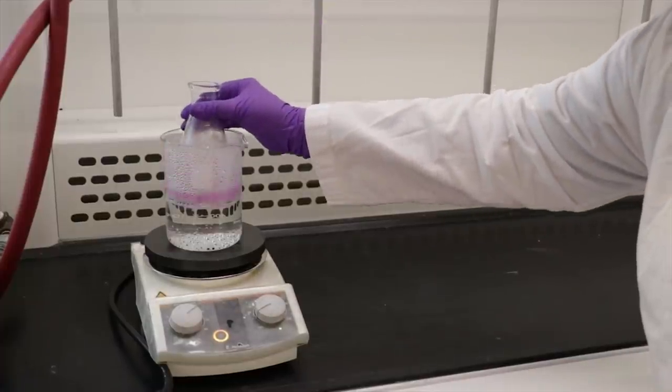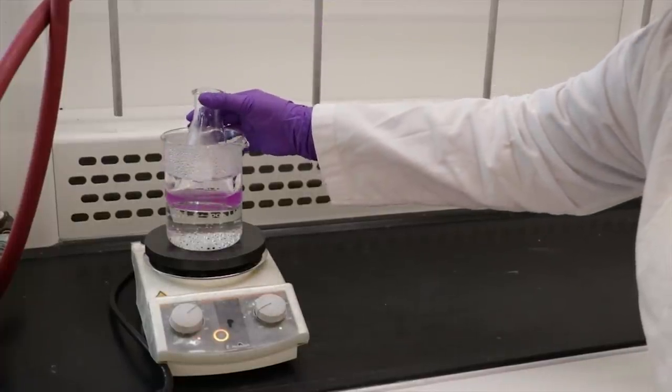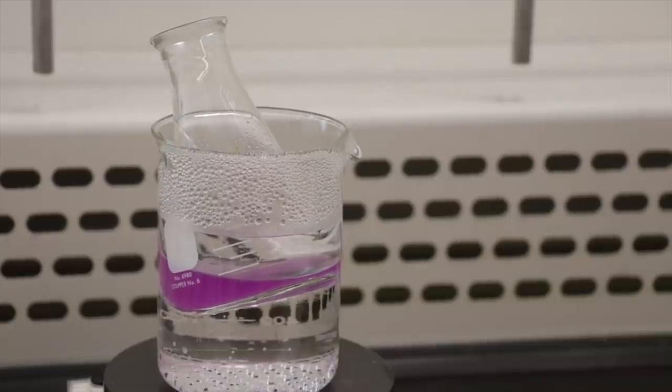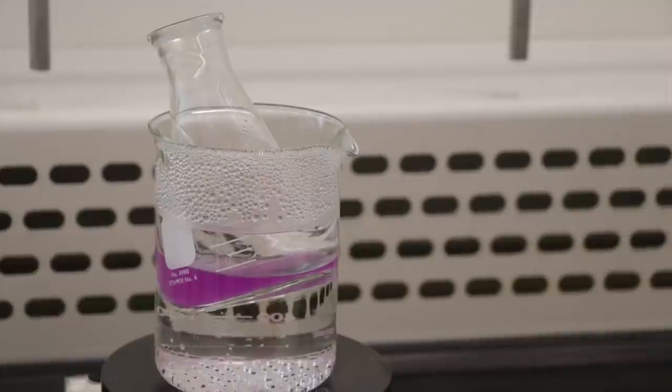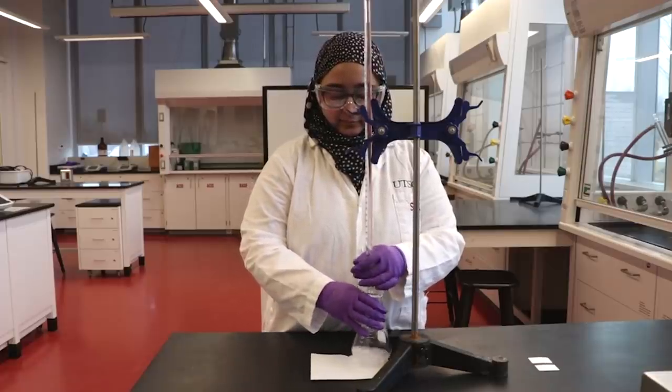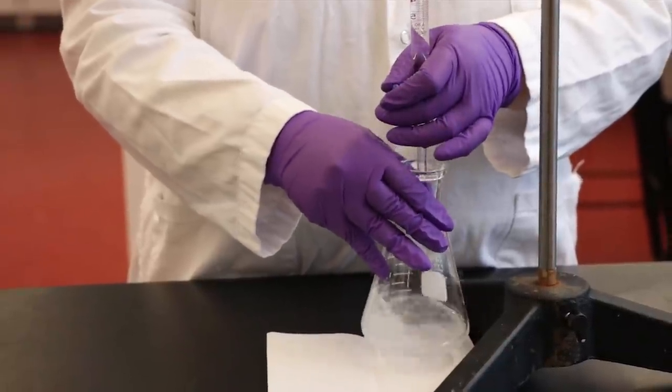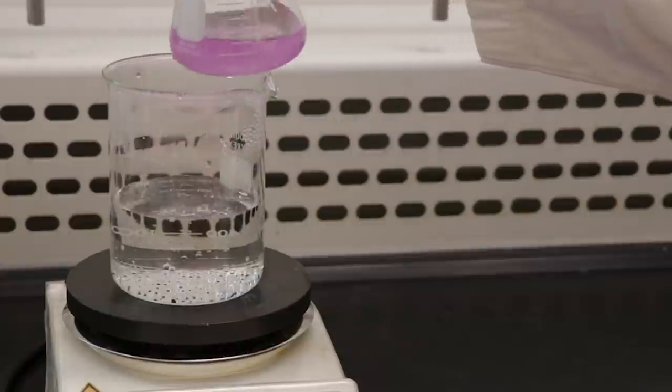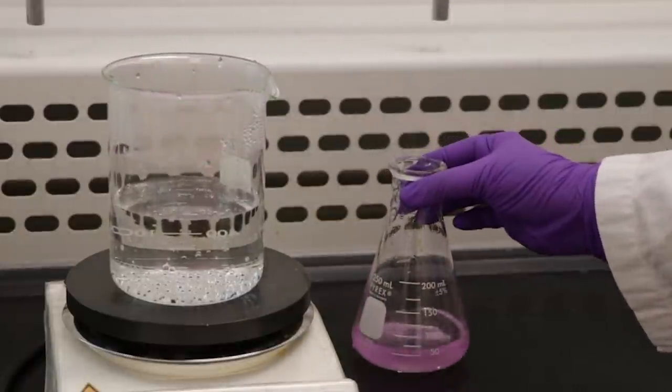Prepare a boiling water bath and heat the Erlenmeyer flask on the water bath for 15 minutes. Do not place the flask directly on the hot plate as ethanol is flammable. In the meantime, start another trial. You will be expected to complete a total of three trials. After 15 minutes, remove the flask from the water bath and allow the solution to cool to room temperature.